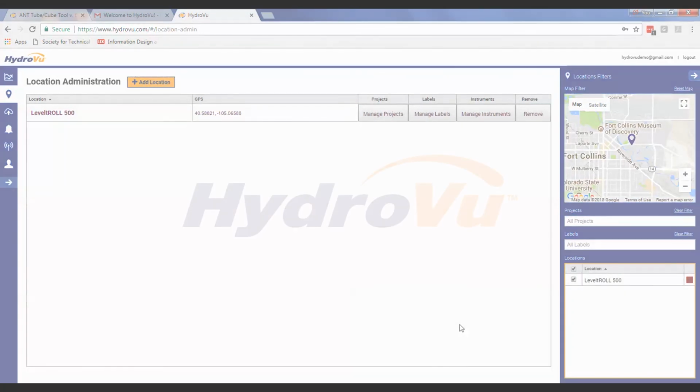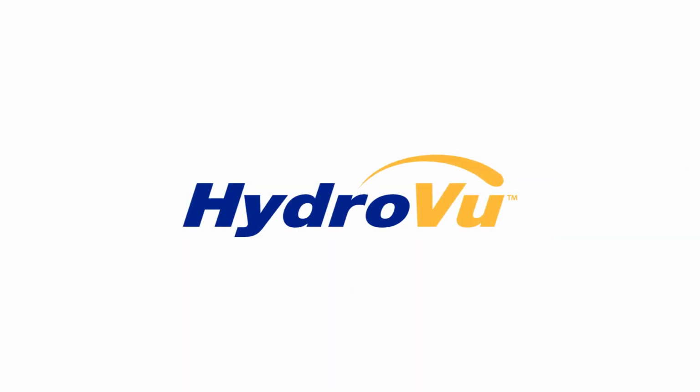That's all there is to logging into HydroVu for the first time in basic setup. Please check out our other HydroVu videos to learn more.